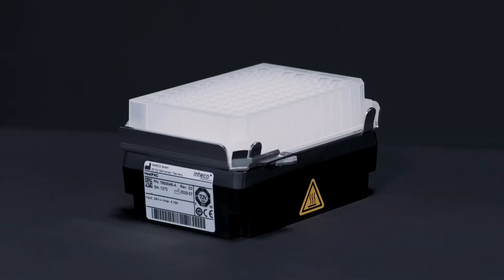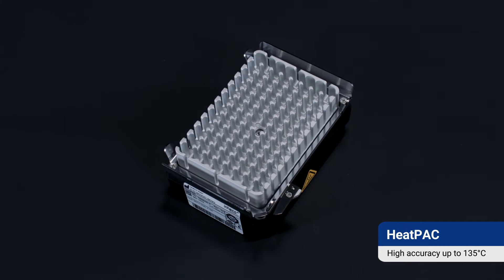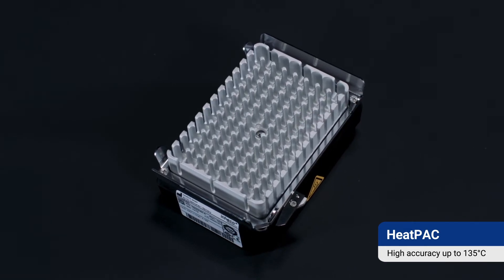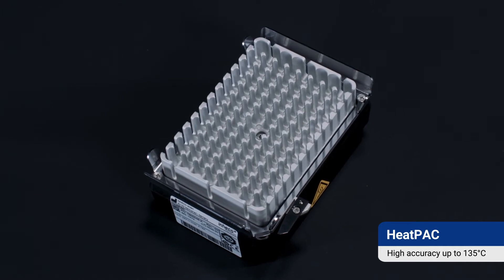The HEATPACK delivers uniform, accurate heating of disposables within standard application parameters and is able to heat disposables up to a maximum temperature of 135 degrees Celsius.